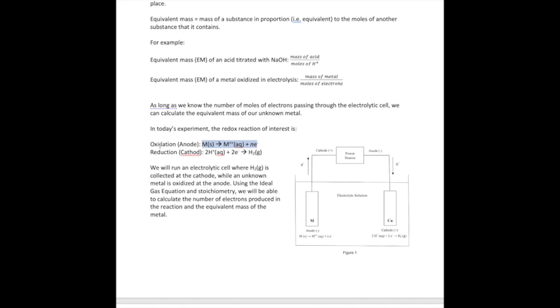Of course, redox reaction can't happen just one half of it. The reduction has to occur on the other side. On the cathode side, which is where reduction occurs, we have a reduction of H plus into hydrogen gas. What you expect to see is that the metal is going to lose its mass, because initially you have solid metal, but then it becomes aqueous when it turns into ions. And then on this side, you're going to see bubbling because of the production of hydrogen gas.